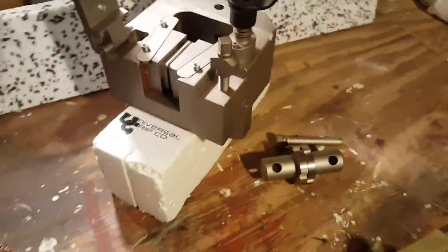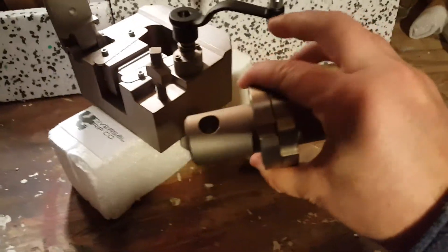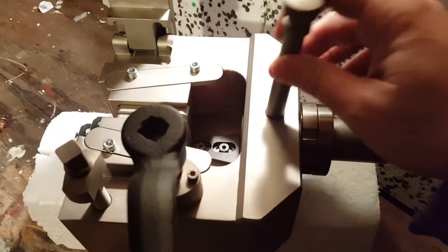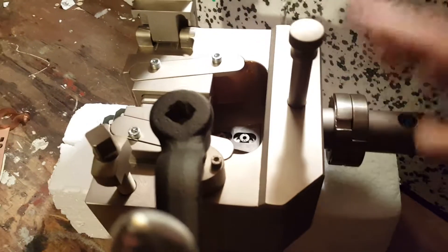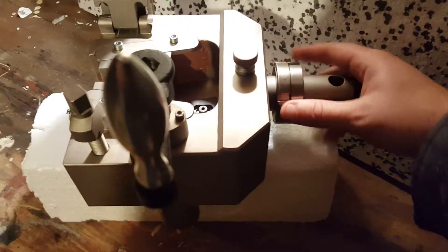This grip attaches to the universal testing machine by means of a clevis pin style adapter. This is a male to male adapter, probably one of our most common here. This would connect into any DF style coupling — I just throw it in with the locking pin and then we have jam nuts to tighten it.